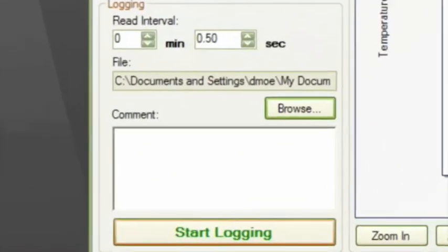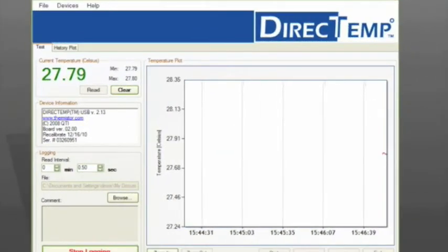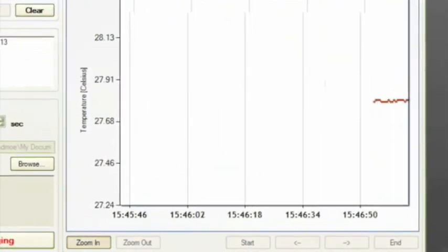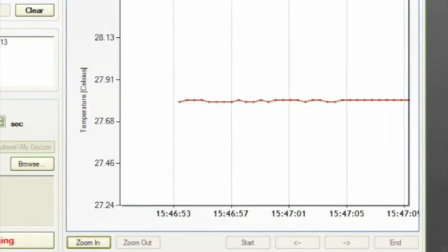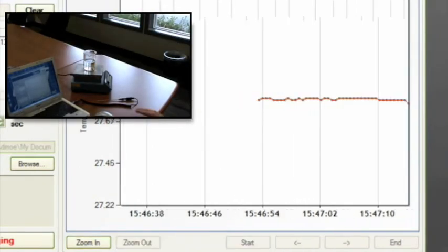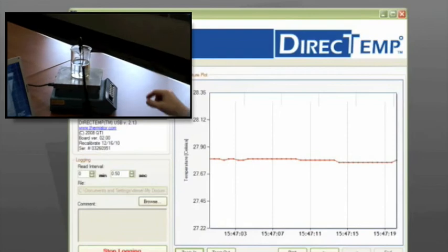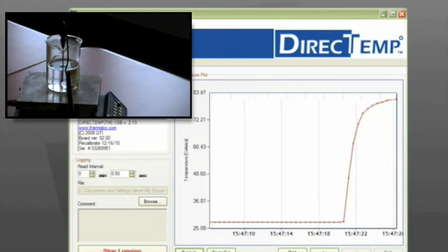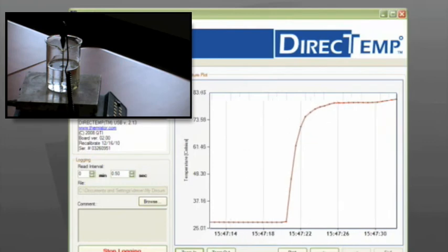All right, now let's start collecting some data. Click on start logging and you'll begin seeing reads. Now you can zoom in and out or move the start or end points while the probe is logging. Right now our probe is sitting on our workbench. I want to collect data from the beaker, so let's move the probe to the liquid on the hot plate and see the reaction time of this probe style. As you can see, the probe reaction time is extremely fast and it stabilizes quickly.